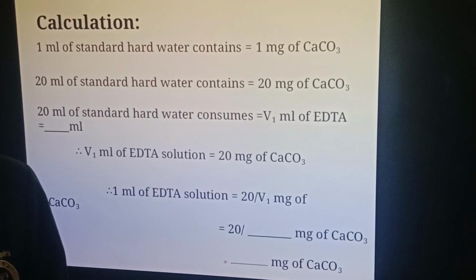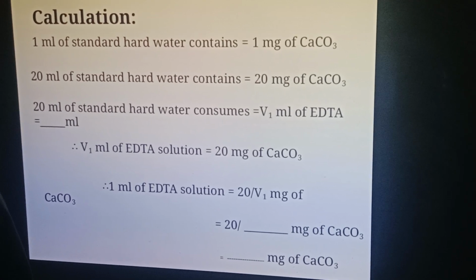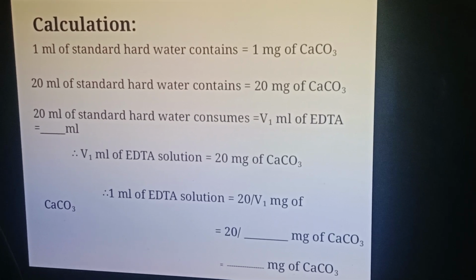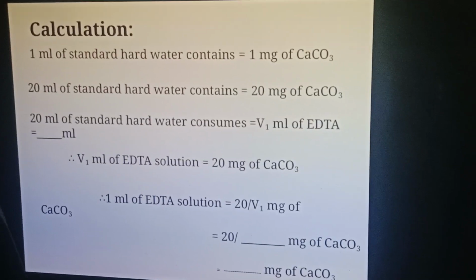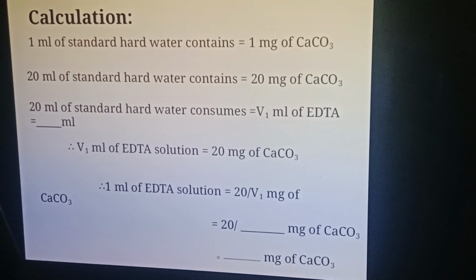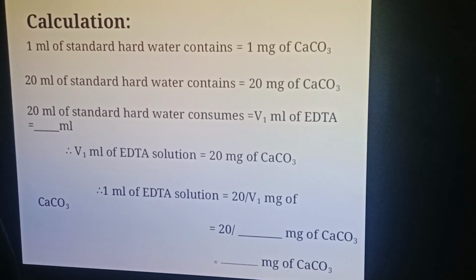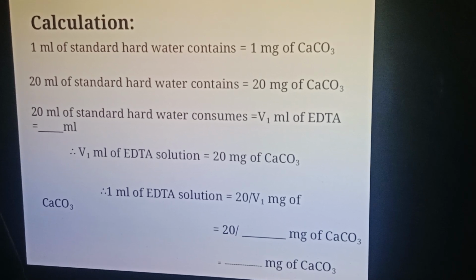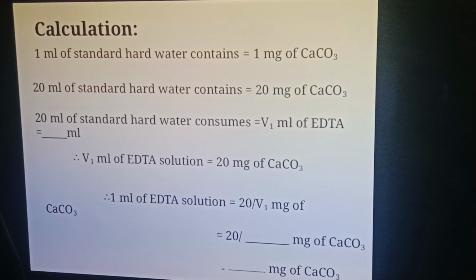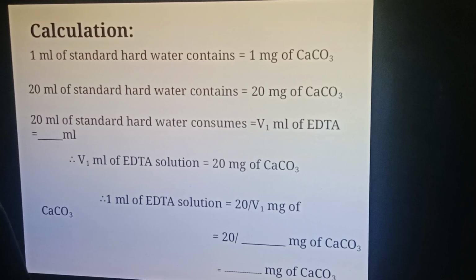Do not assume the concordant value means an average. First, identify the matching reading. You must perform at least three titrations. Out of these, if two or more titre values are exactly the same or very close, usually within plus or minus 0.1 ml, they are called concordant values. So concordant value is not a mean value or average. They are the matching or repeated values that indicate your titration is accurate and repeatable. After identifying the concordant values, you should enter them in the respective column.